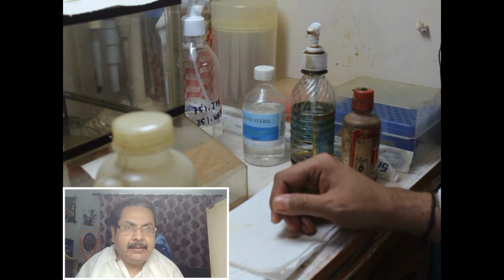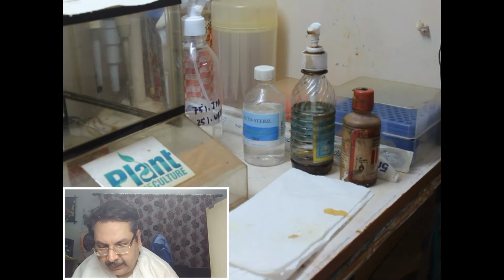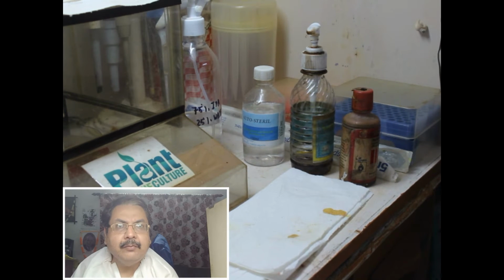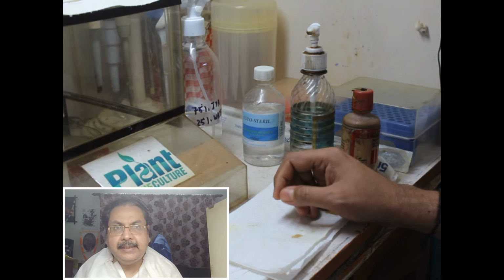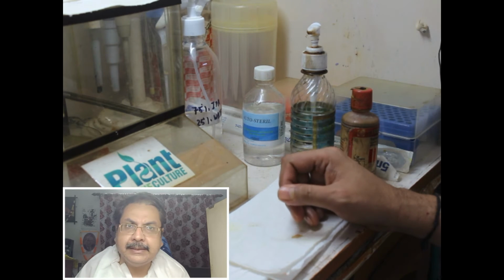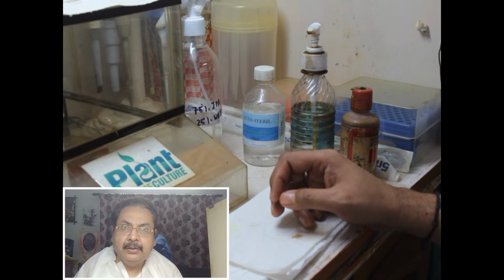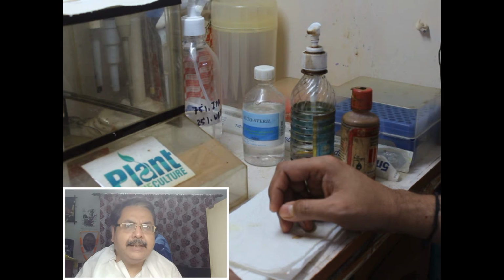Another meter is there, that is called TDS meter, which I was talking about as the second term, the TDS. TDS you will be able to see in a TDS meter. TDS is measured in meters. TDS is not measured by reagents. It is not accurate to measure by reagents. It should be measured by a meter. So that is called TDS meter. TDS meter means total dissolved solids meter. So that is also there.